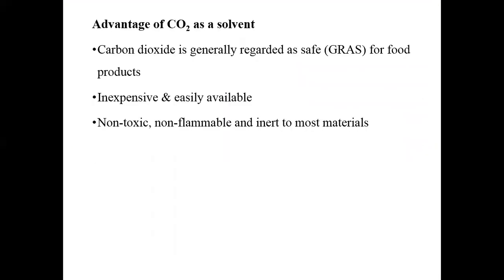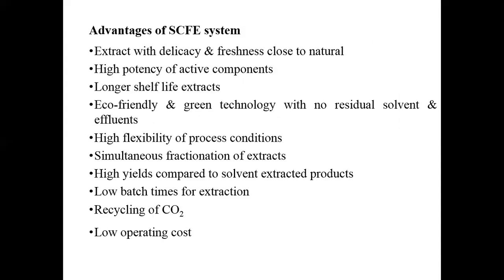So these are the advantages of selecting CO2 as a solvent. Carbon dioxide is generally regarded as safe for food products. It is inexpensive and easily available. It is non-toxic, non-flammable and inert to most materials. These are the advantages of the supercritical fluid extraction method.